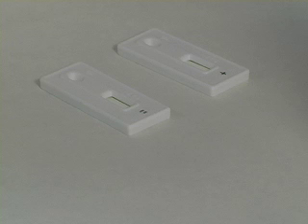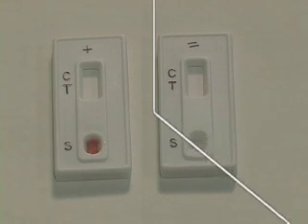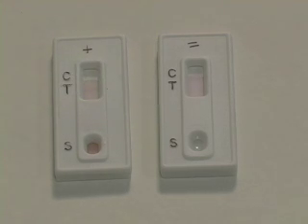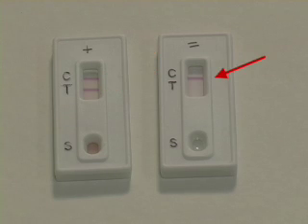The ABA card is then removed from the sealed pouch and labeled properly. 4 drops of the sample are then added to the sample well, labeled S, on the ABA card. After 10 minutes, the results are read. The presence of 2 pink lines, one in the T area and one in the C area, indicates a positive result. The presence of only 1 pink line in the C area indicates a negative result. If no pink line is present in the C area, the test is invalid.